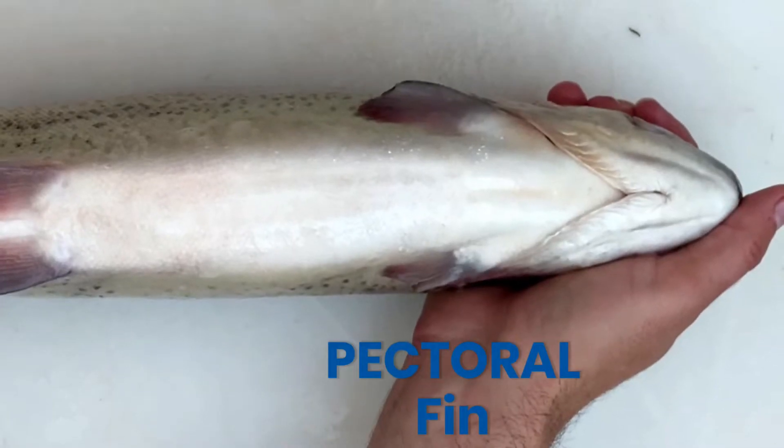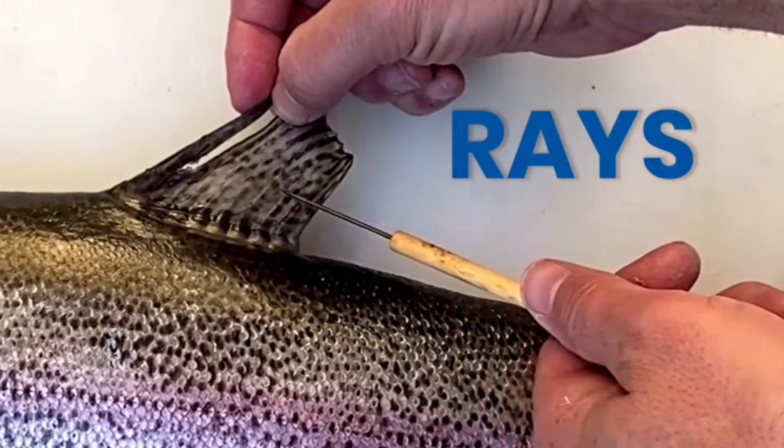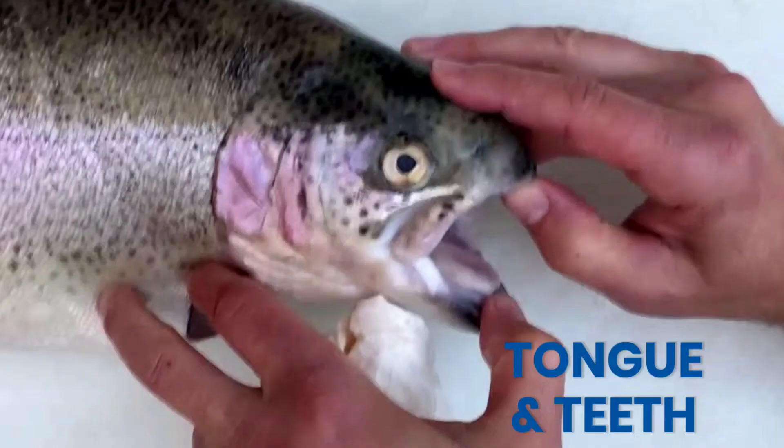In most bony fish, the fins are supported by rays of dermal bone rather than cartilage, which you saw from the sturgeon dissection video. What else can we label on the external fish anatomy?